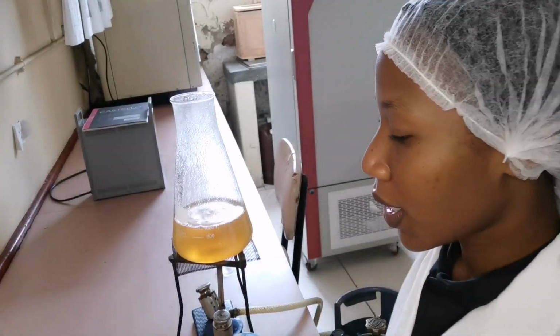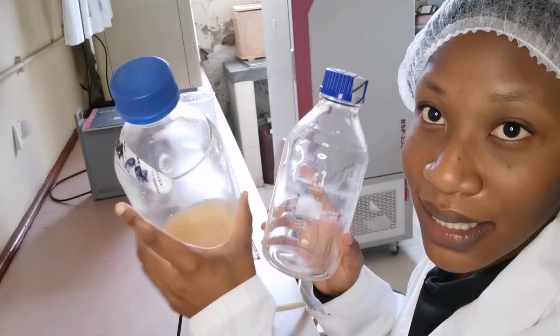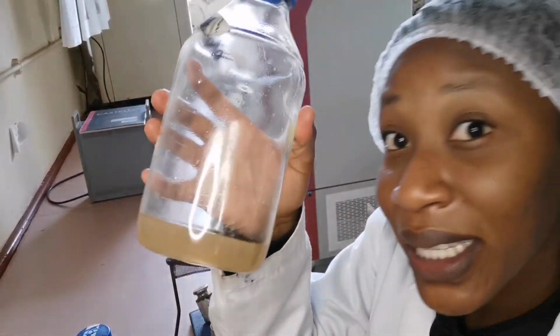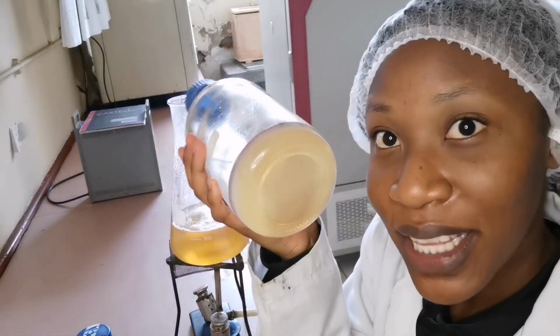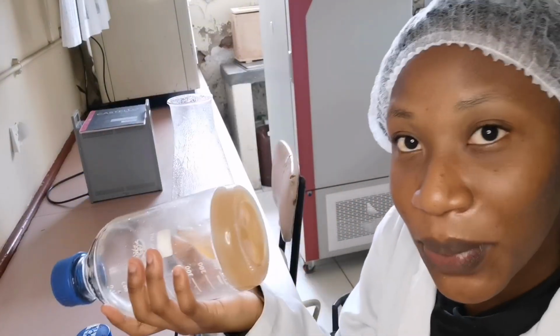I'm going to be pouring the agar into these 2 containers, this one and this one. This is the leftover agar, but it's too little for the milk samples that are arriving today, so I just had to make some more PCA agar.